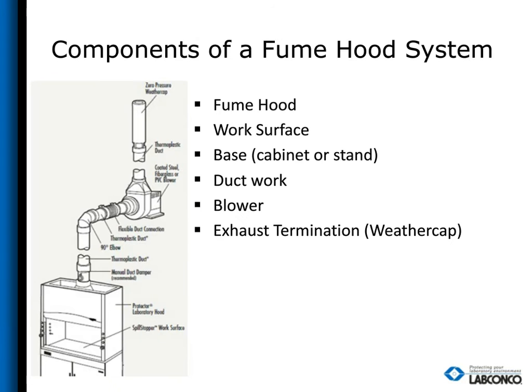So to start things off, here are the components of a fume hood. This image shows a typical fume hood exhaust system when tied to a remote blower. Sometimes I get phone calls where people assume a blower comes attached to the fume hood, and that's a scenario we call a built-in blower or an integral blower, and that's not necessarily the case. Some people are kind of surprised by that.